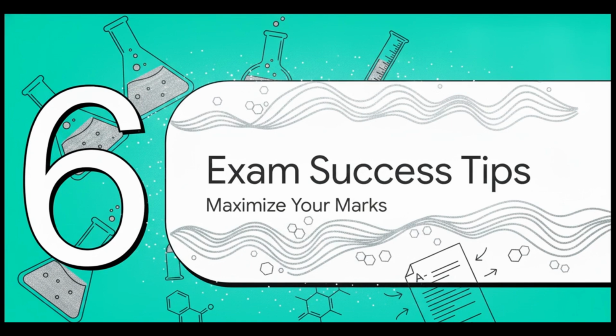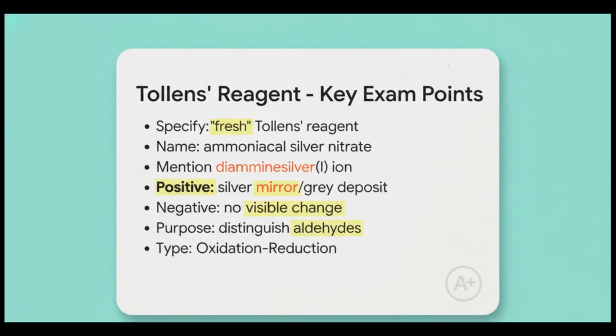Finally, Section 6, A-Level Exam Success Tips. Maximize your marks. Okay, here is your rapid-fire cheat sheet of mandatory observations. This is exactly where students always seem to drop marks by being just a little too vague. When you write about this, you absolutely must specify that the reagent is fresh.